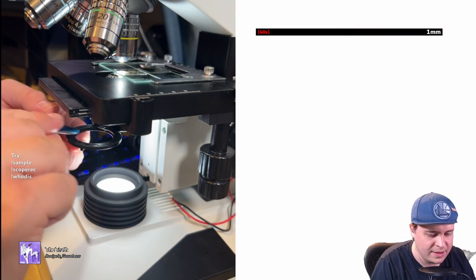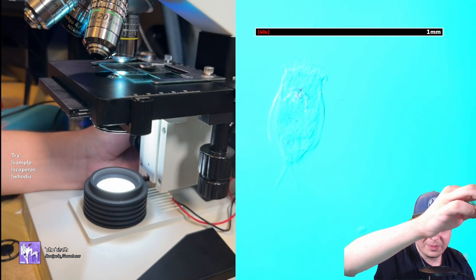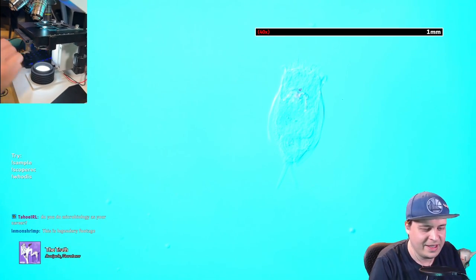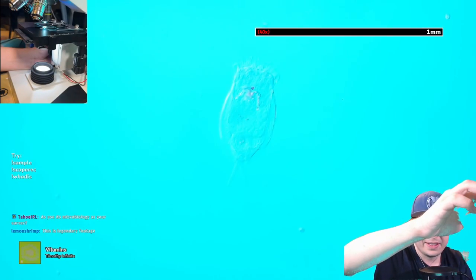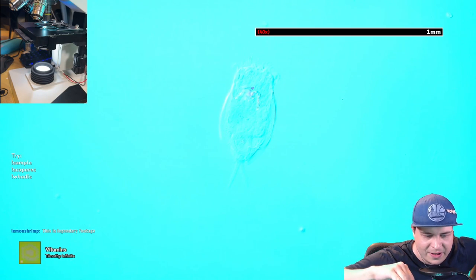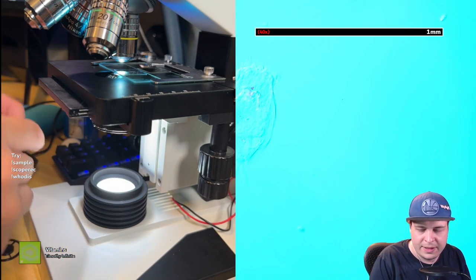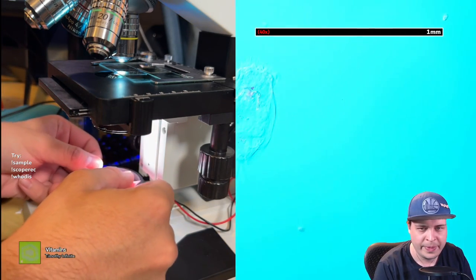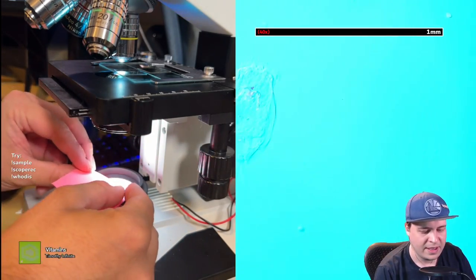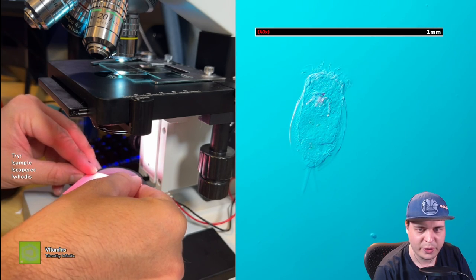I'm going to put that filter in — my camera plays very funky with this, it actually looks a lot better through the eyepieces. But already with this teal background you can see that one side of this rotifer is shaded brightly and the other side is shaded darkly. Now I'm going to intensify this by sculpting the light field. I'm going to add a post-it — the filter's gradient is oriented about 45 degrees across — and darken up the side that's already dark.